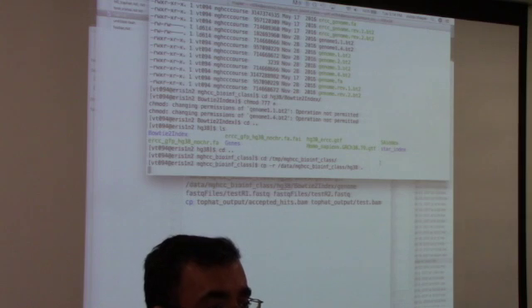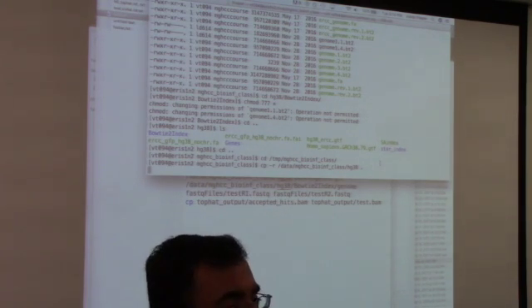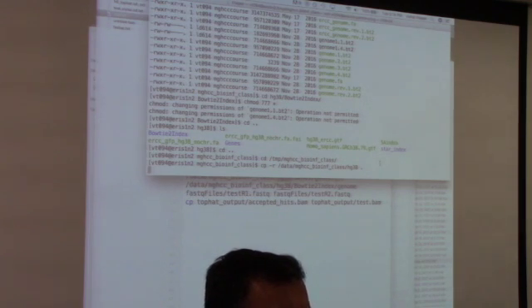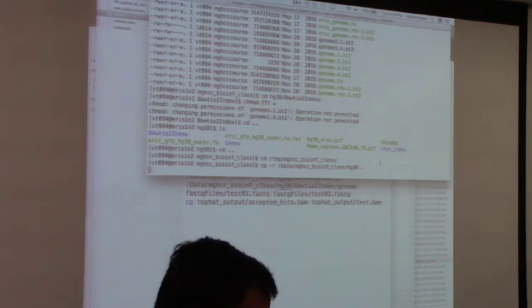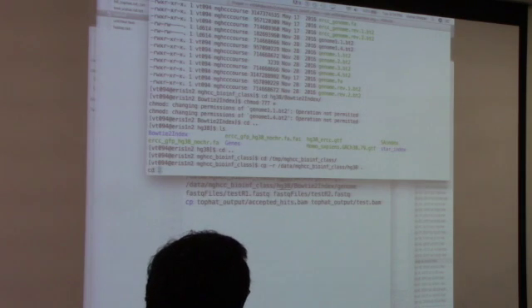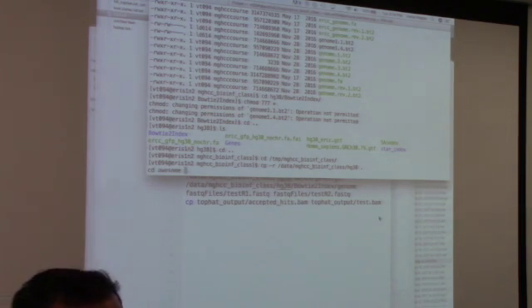Once you log into your home directory, where do you want to copy this? Do you want to copy this in your awesome directory, since that's where you're going to do your analysis? So then you're going to cd awesome. Once you're in your home, logged in, cd awesome. Do that, and after you're in your awesome directory, let me know if you're there.